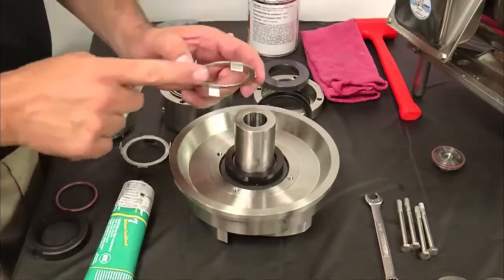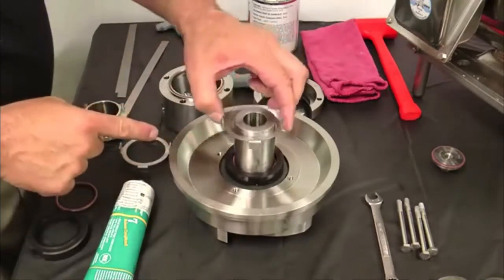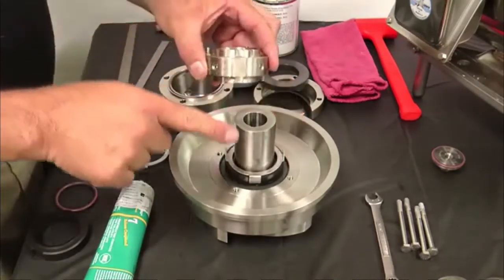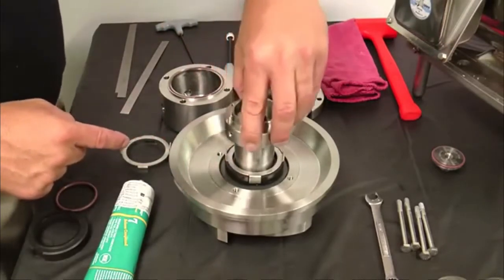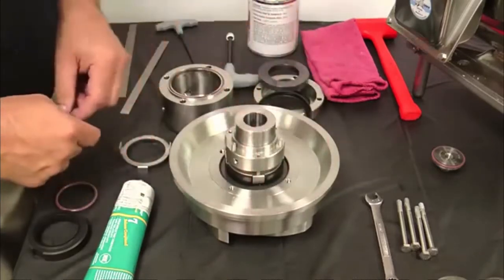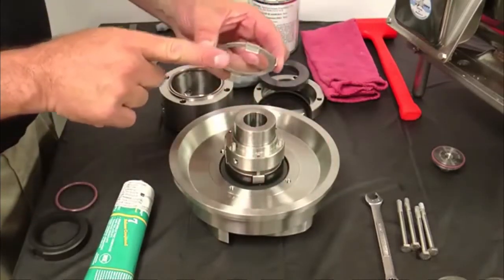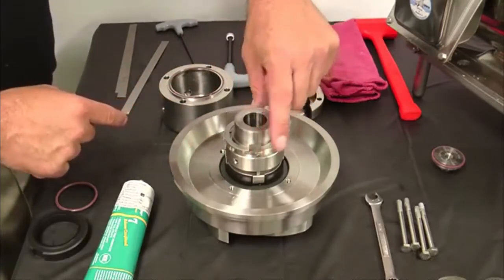Line up the tabs of the tab washer with the slots on the seal and place the tab washer onto the seal. Install the spring retainer over the impeller shaft, making sure to align the slots of the spring retainer with the tabs of the washer. Place a second tab washer onto the spring retainer with the washer tabs aligned with the slots on the spring retainer.